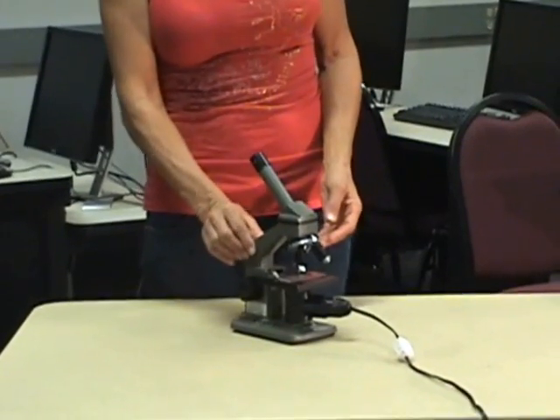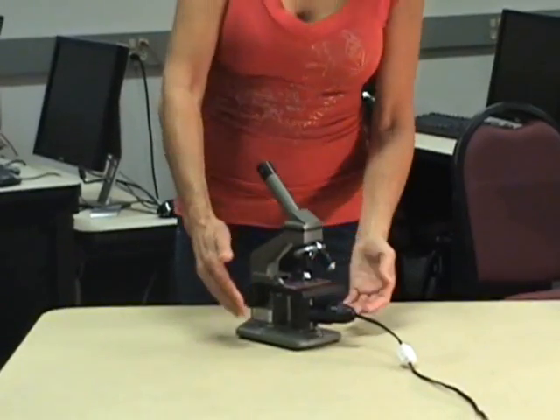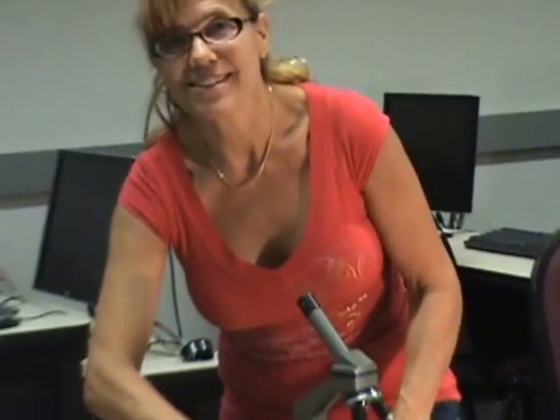This part right here is called the arm. Down here we have the mechanical stage. This is the illuminator, and you guessed it, it illuminates the slide that you're looking at. This is your focus knob.